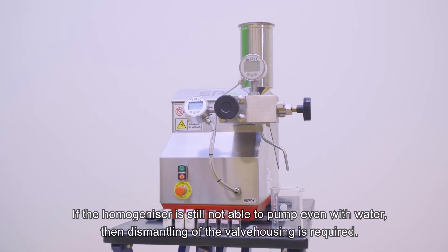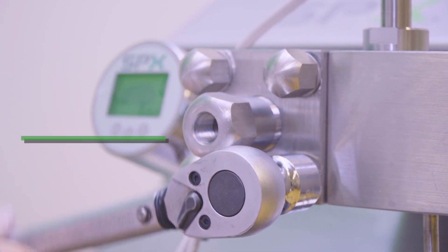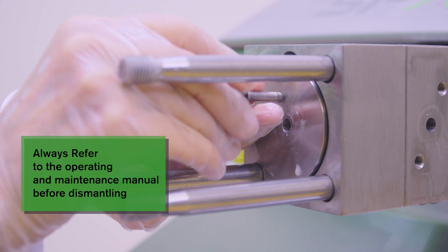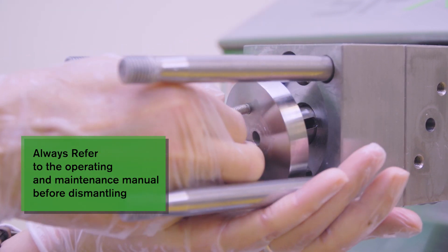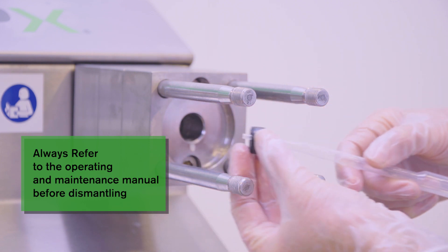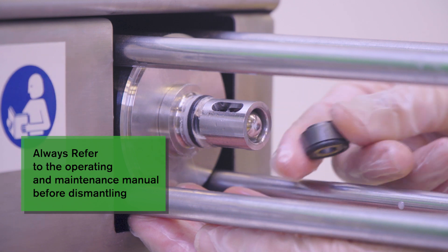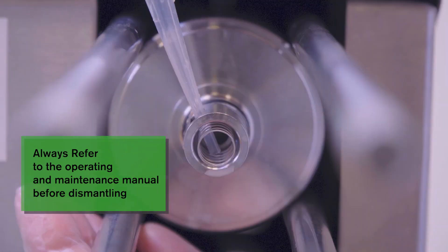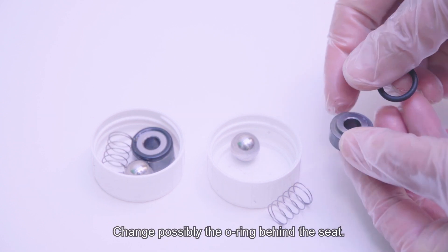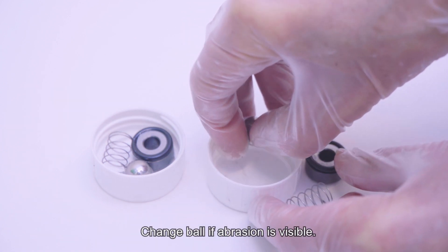If the homogenizer is still not able to pump even with water, then dismantling of the valve housing is required. Remove all valve housing parts. Clean and inspect the pumping valves, their O-rings and springs. Change possibly the O-ring behind the seat. Turn seat if abrasion is visible. Change spring if damaged. Change ball if abrasion is visible.